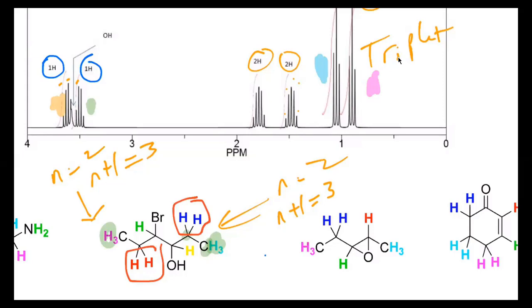You've got three on this carbon, and then one on that carbon. Is that right? Okay. Cool. And then you just do n+1. 4 is n, so it's equal to 5 for both. So let me erase that and cheat a little bit. So n is 4, n plus 1 is 5, for both pentets.